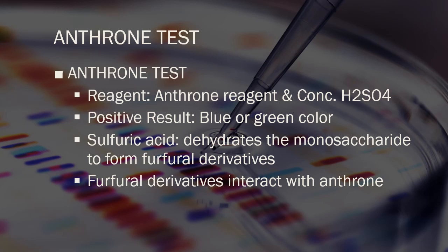Of course, before you did your Molisch test, you first prepared your sample. You placed an amount of ethanol in a boiling water bath.